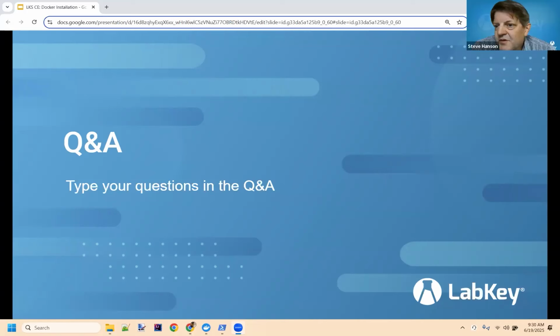And I had a question for Stuart. This is a pretty broad question, but do you have any best practices that you want to make sure people follow when working with the Community Edition? Sure. One of the things you may want to consider is looking at that Docker Compose YAML file that is in the repository.